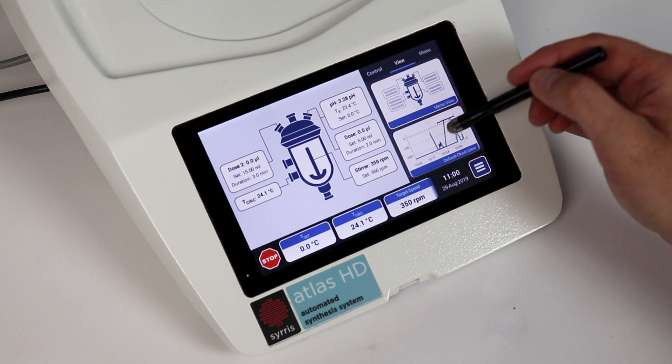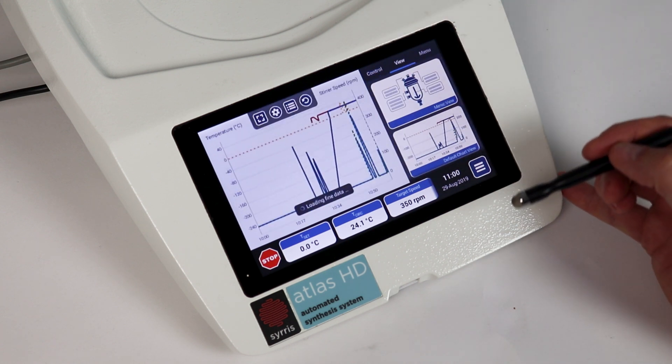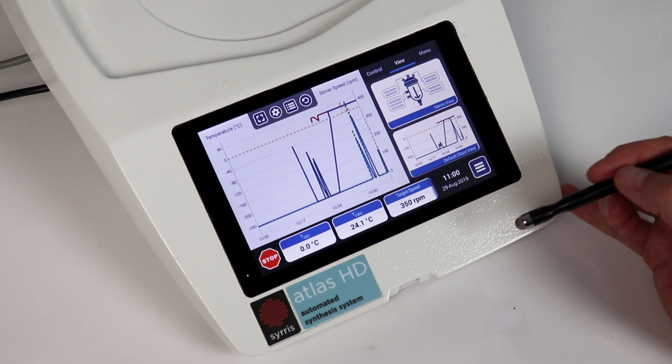All data is displayed graphically in real time, with data for all hardware being saved in a single CSV file for convenient analysis.